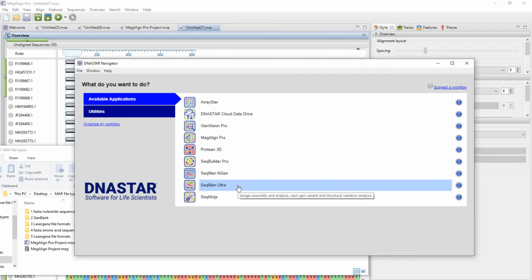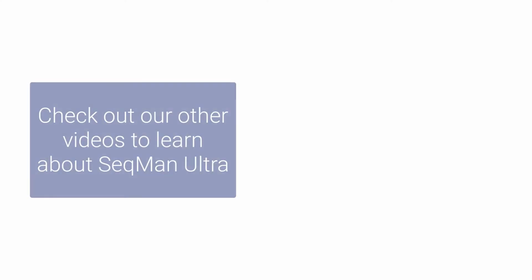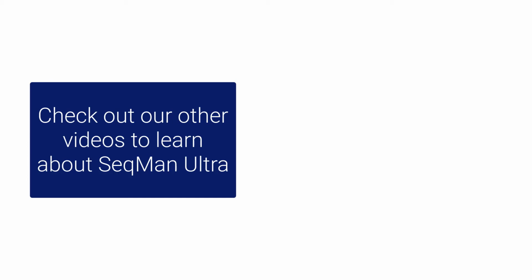Last thing I want to say about that is that if you really wanted to bring in those raw reads, you can bring them in through the SeqMan Ultra application and convert them into Fasta file, and then they could be brought into MegAlign Pro if that was something you really needed to do.